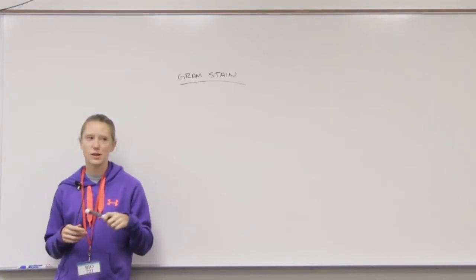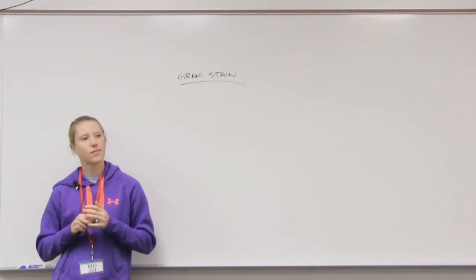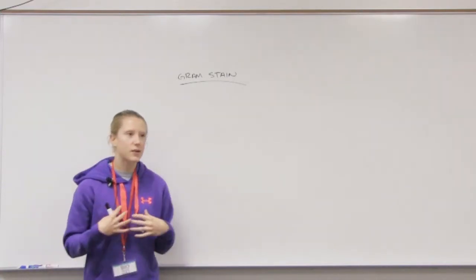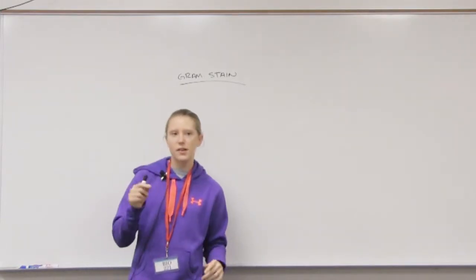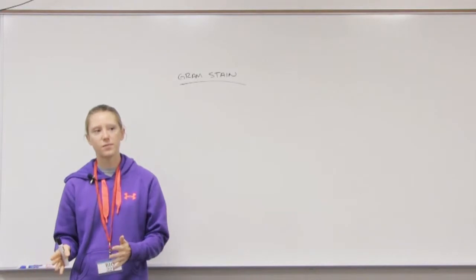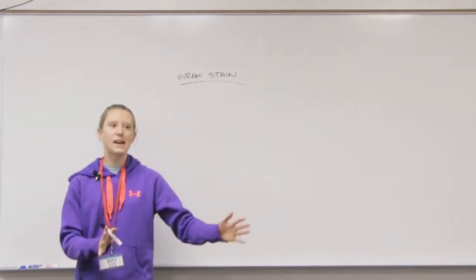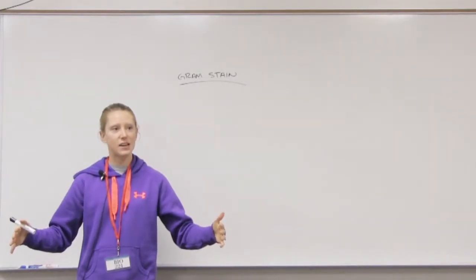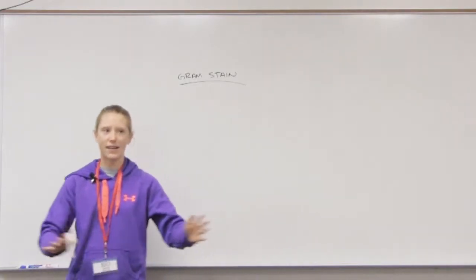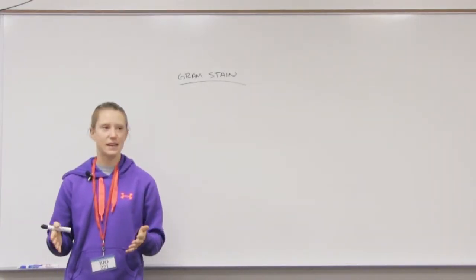Okay, that leads me to our next question. Why do I do a gram stain? To differentiate between microbes. If someone comes into the hospital and they're sick, I take a swab of their throat and I do a gram stain, just from it turning red, what do I know? Gram negative, right? So then 50% of my available diseases, any disease that's gram positive, I know immediately they don't have that. So I can narrow it down by 50% just from the gram stain.